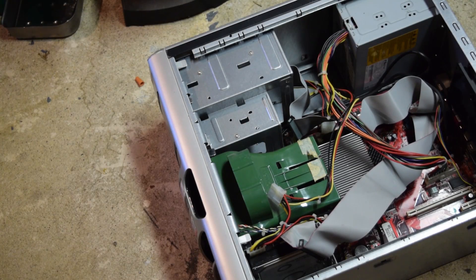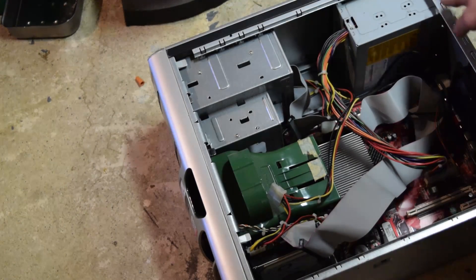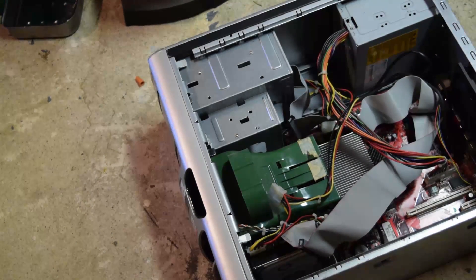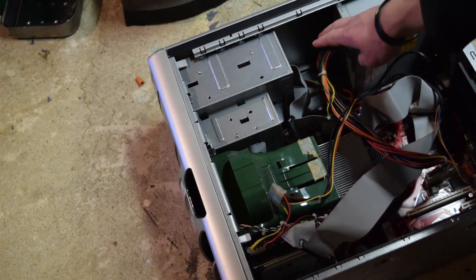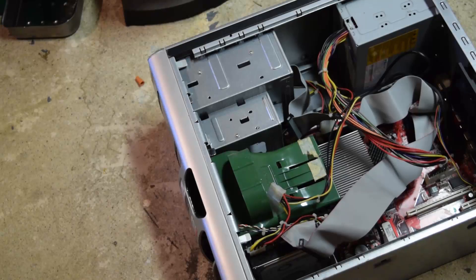The first thing you're going to need to do for this project is isolate three parts from the computer. The first one is the power supply. This is usually a rectangular steel box located in one corner of the computer and it has a wiring harness connected to it that's pretty easy to locate.